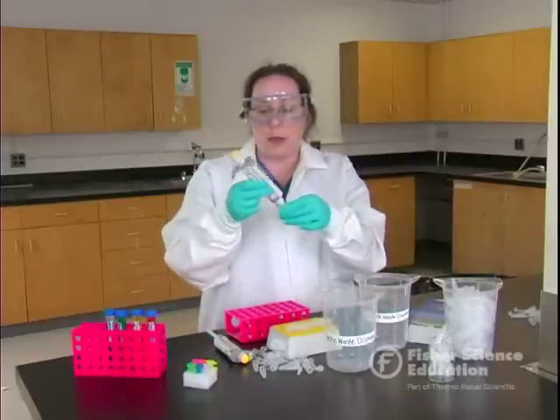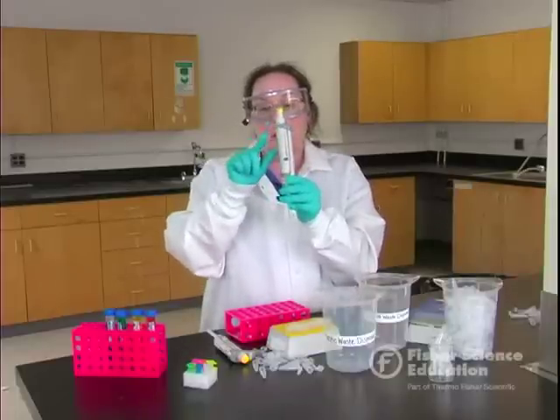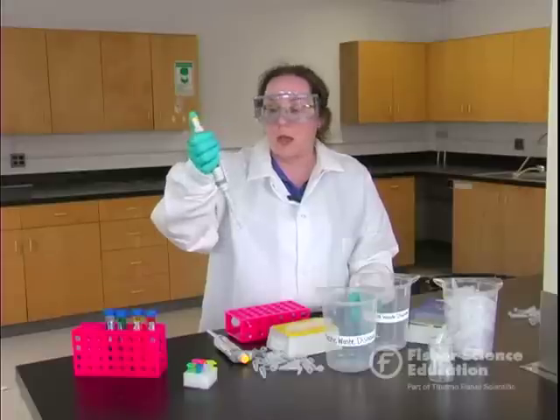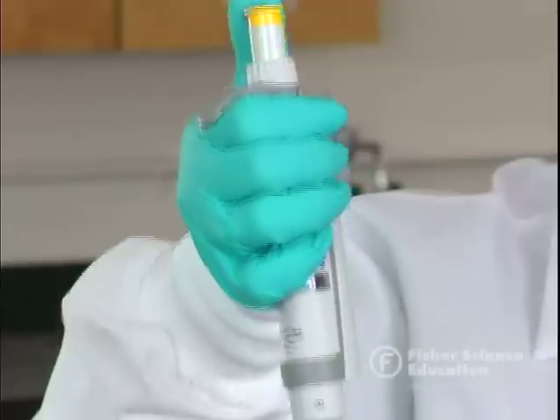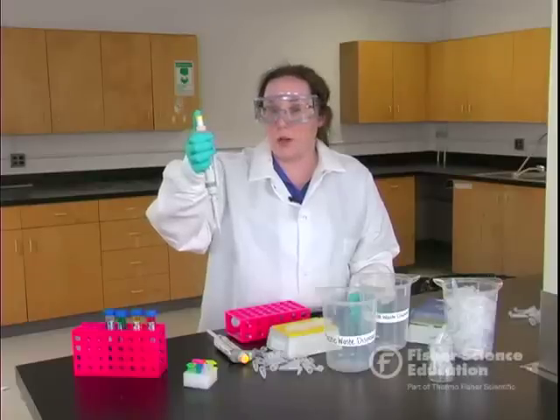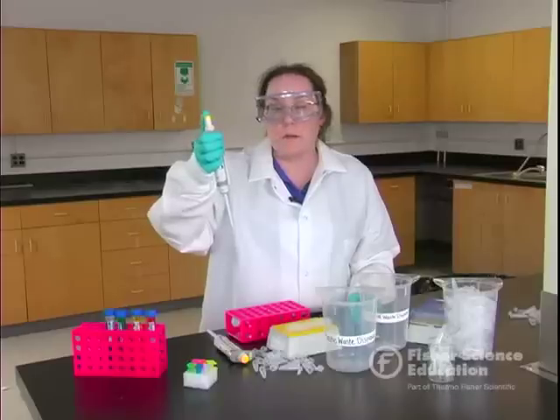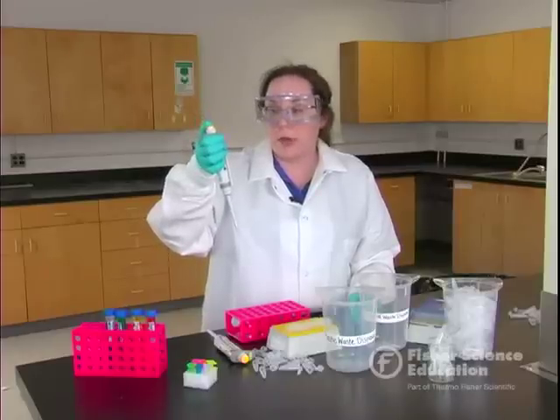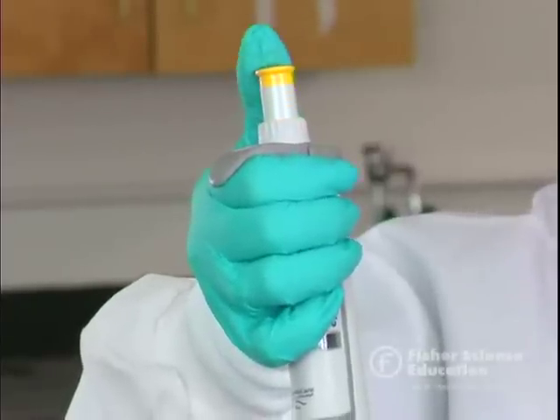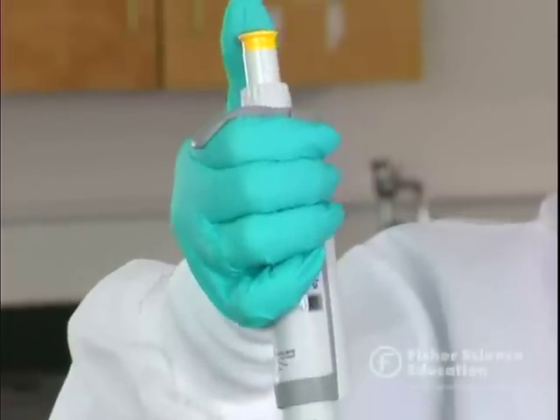So this is a pipetter. You always want to make sure that you've got a tip on it when you use it. There's always going to be a hook back here that hooks over your hand, and you're going to depress the plunger with your thumb. On the pipette there are actually two stops — you can push once and then twice. There's the first stop and the second stop. To help students get used to it, I like to do a little thumb aerobics exercise — practice going to the first stop up and down about five or ten times.